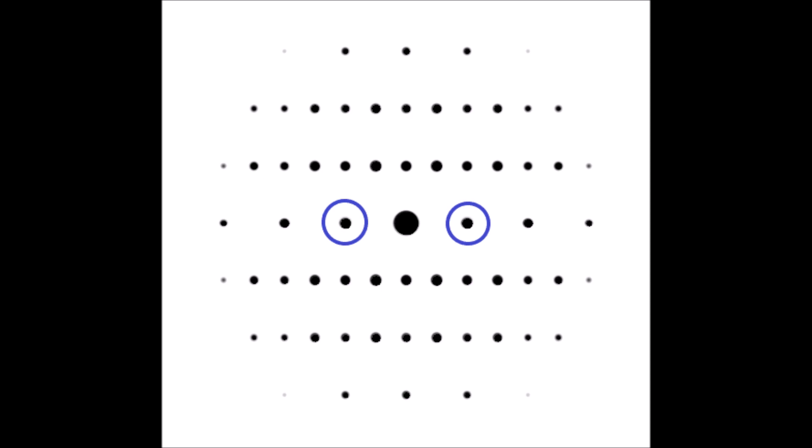And we can tell how well aligned with the zone axis we are by looking at the diffraction pattern. So if I am well aligned with the zone axis, what I'm going to see is that if I take two Bragg spots, meaning a Bragg spot and its opposite.